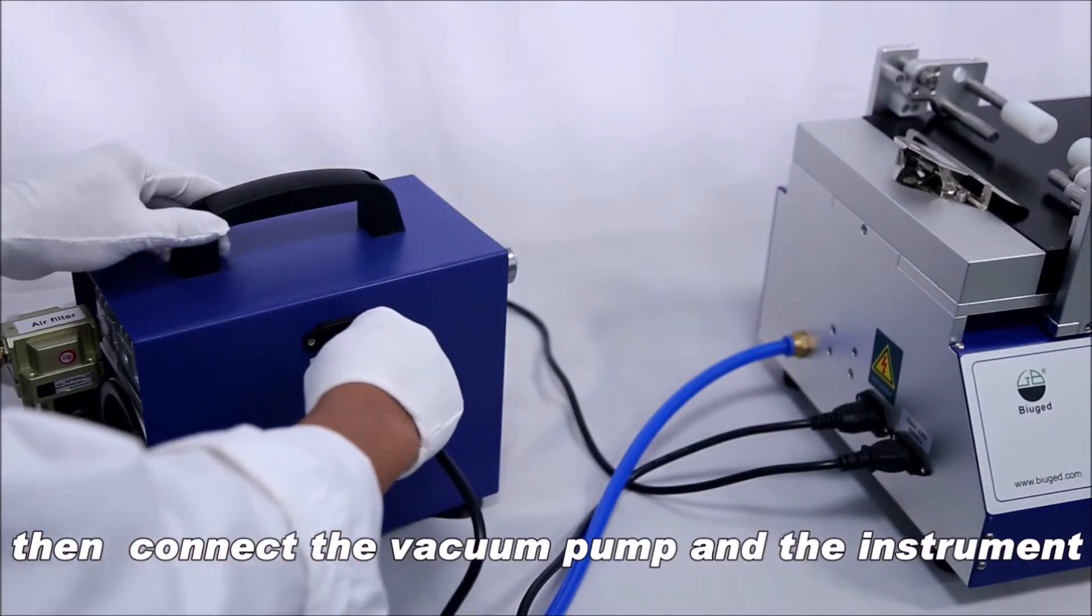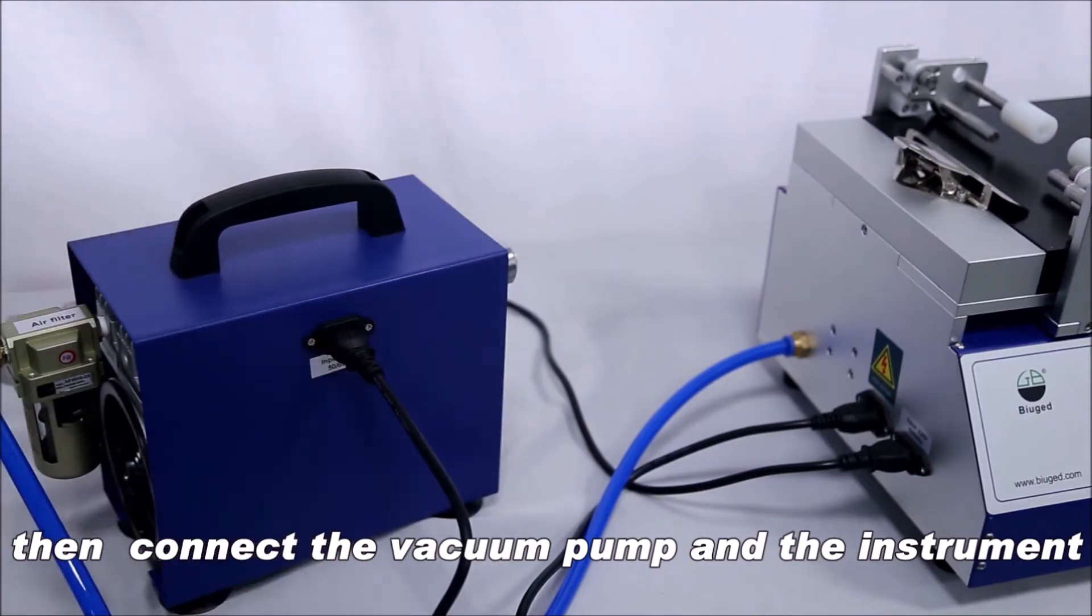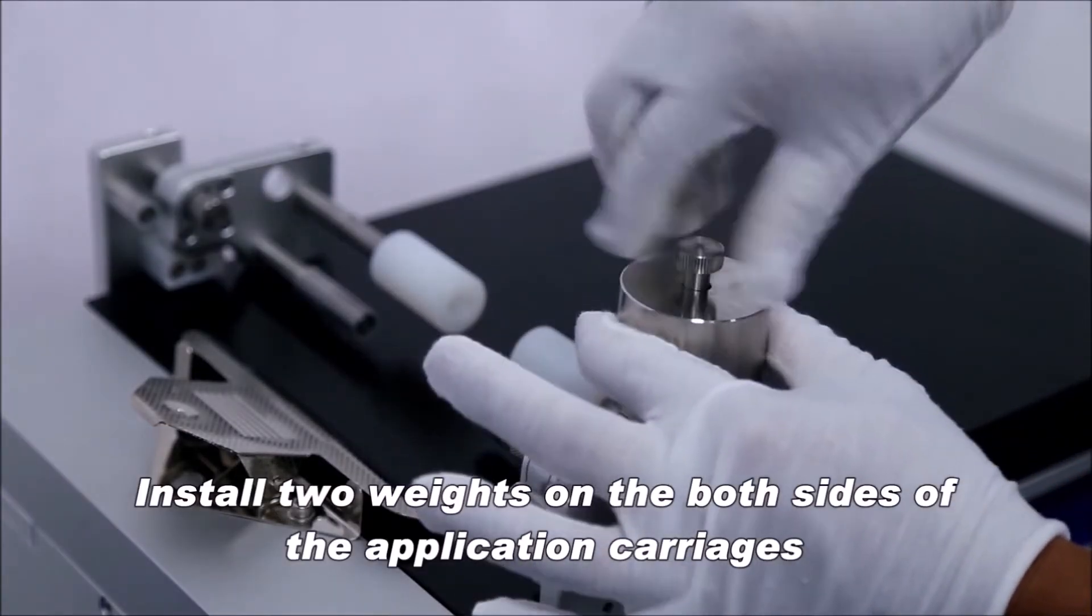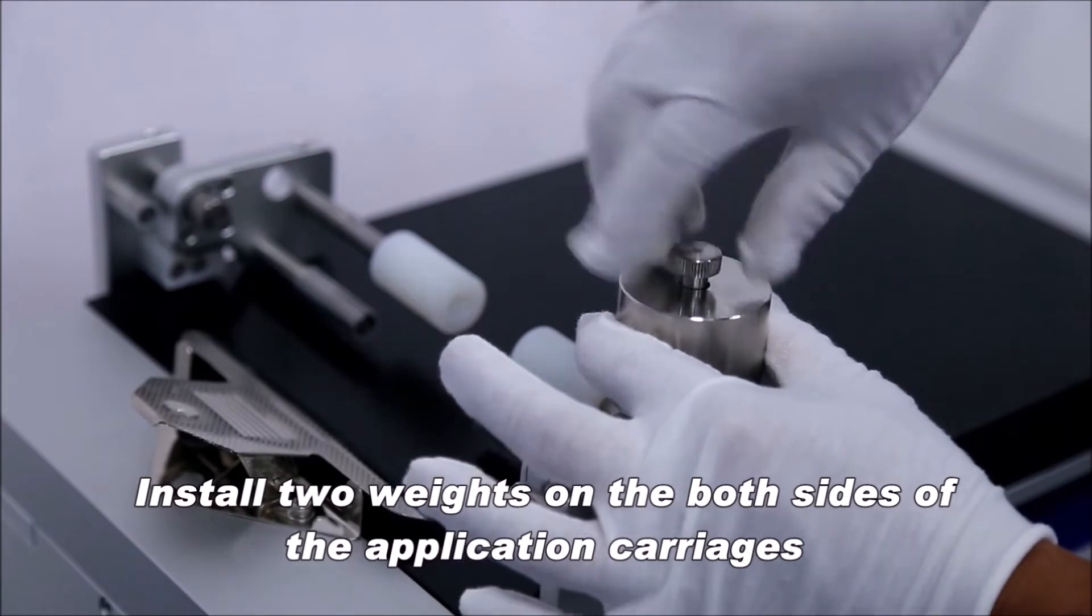Then connect the vacuum pipe and the instrument. Step 4: Install 2 weights on both sides of the application carriages.